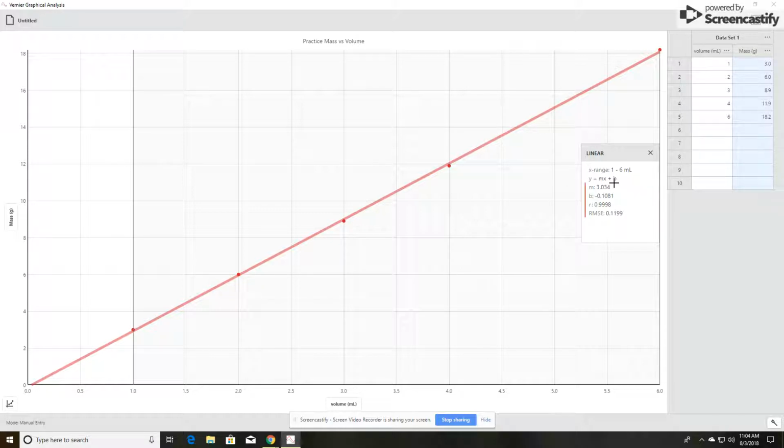The nice thing about this also is I believe up here, we can decide how we want to do this. We can have different graphs to show different things. I always want to make sure students have the graph and the table when they print it. And then I believe if we go over here to save as, we can export it. And if I export it, we can do a graph and image, or it'll put it in a spreadsheet. So there's all kinds of ways that this really turns out to be helpful.